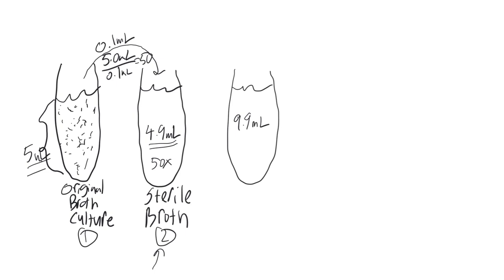Now I'm going to take a small amount from the second tube and dilute it into this third tube here. So we're going to go from here to here.